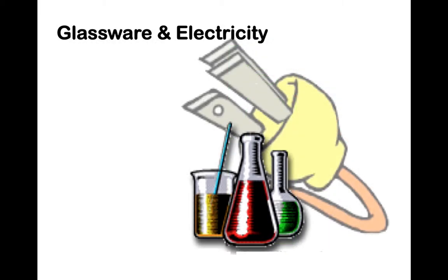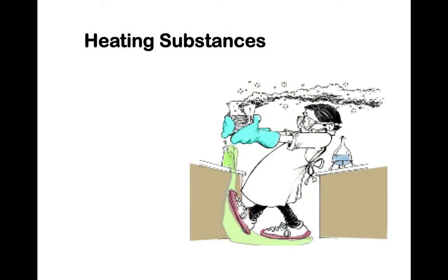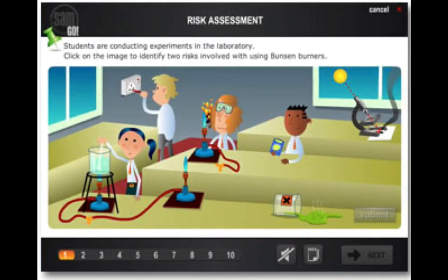Of course, when you use glassware and electricity, you, the teacher, are the one who's going to take care of the glassware and electricity, not the students. When heating substances, of course, you need to use tongs or heat protective gloves.